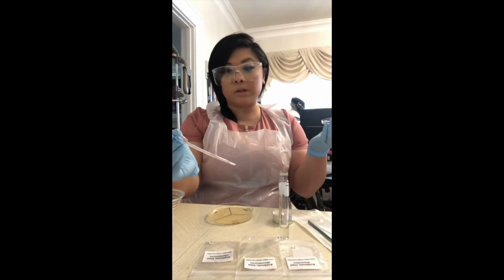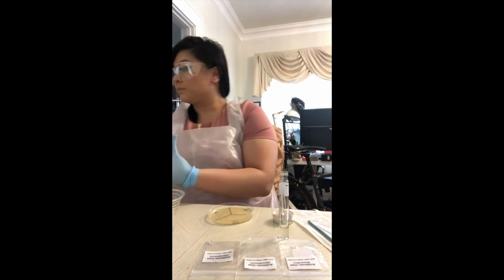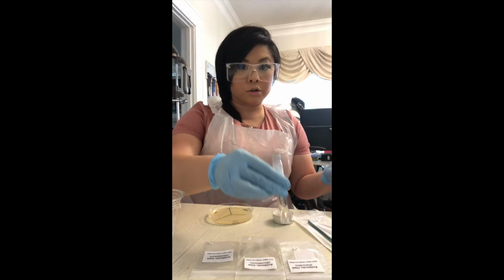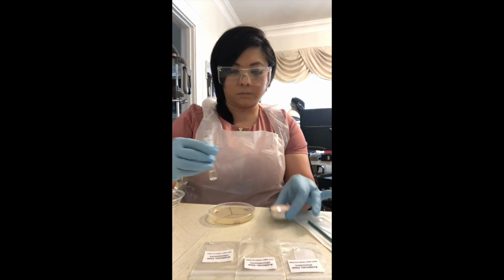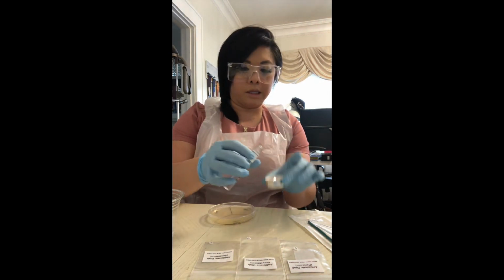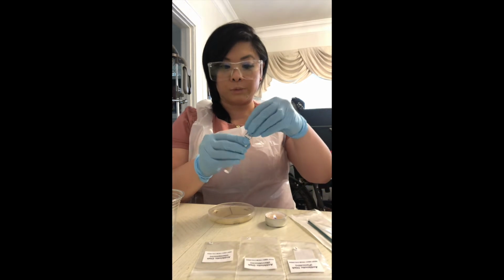Then I'm gonna dispose of this in my bleach. And then I'm gonna reflame my active culture. And then I'm gonna place it back in the refrigerator for future experiments.